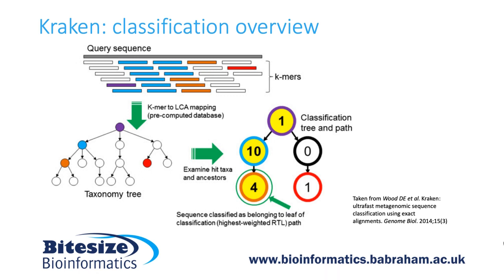So this is how Kraken assigns reads to taxonomic classifications. It will try and assign directly to species, but if that's not possible, it will work its way up the taxonomic tree.